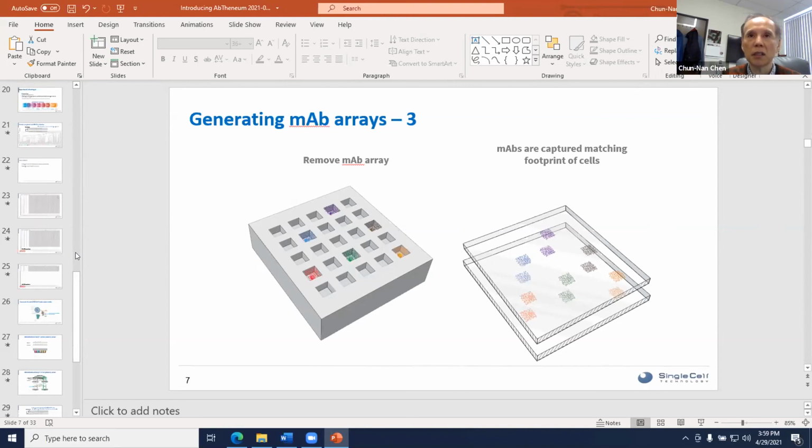And most of the other ones range from the low ones we have seen, 2%. But I think most of them hover around 10%, 9 to 12% of them will be antigen specific. So if we spread 10,000, if we are able to see 10,000 IgG-secreting ones, then the 10% will give us roughly 1,000 of the antigen-specific spots here.